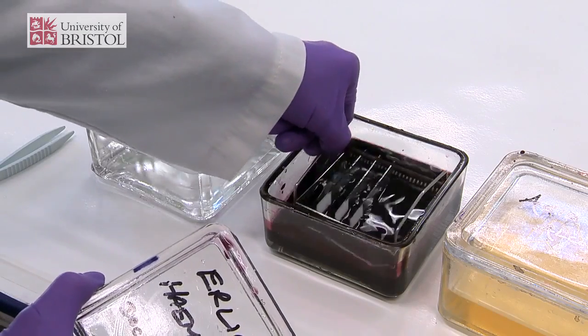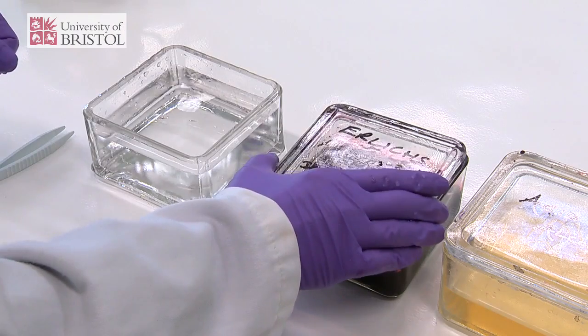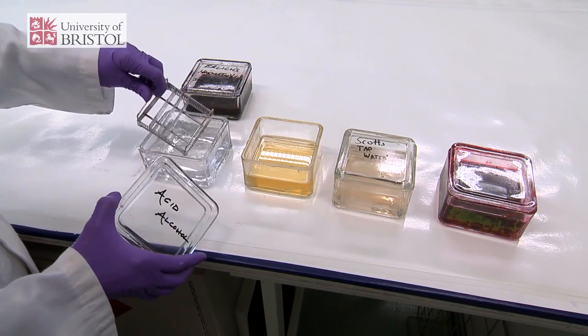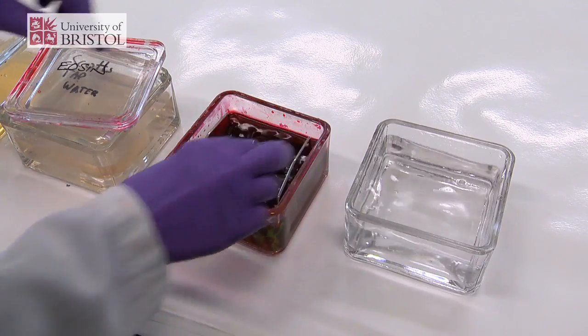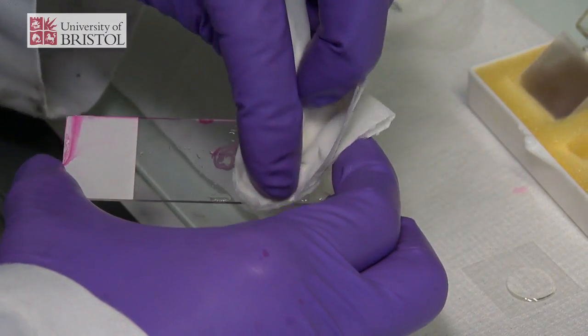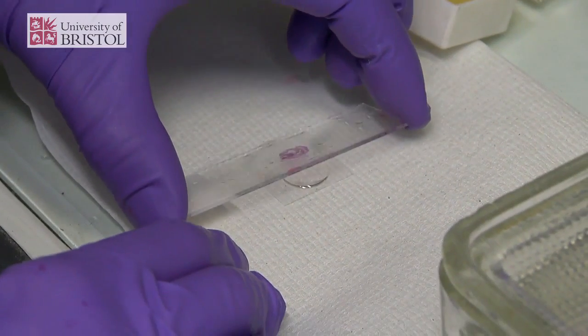We need to stain the tissue because very thin sections of unstained natural state tissue don't have any innate colour, and so it's very hard to make out anything when you look at it down the microscope. We stain tissues with a variety of different dyes and colours because they have different properties, and different dyes will stain different parts of the cells and the tissue, and this enables us to use the appropriate dye to illustrate the part of the tissue or the cell that we really want to emphasise.